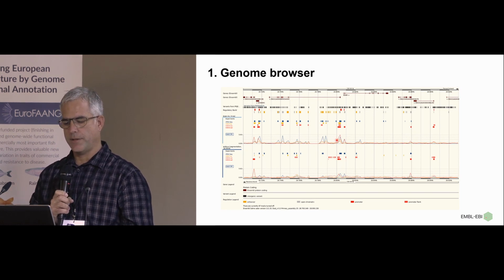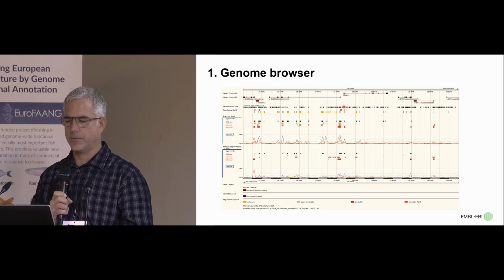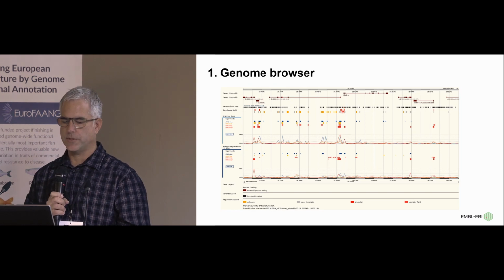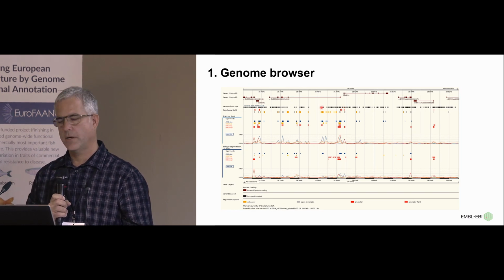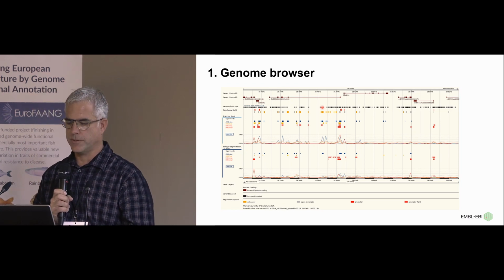down below. And one thing to highlight: one of the goals of AQUA-FAANG is to help focus where variants might be of interest. You can certainly see that some of these variants are going to potentially land in regulatory regions, which are going to be perhaps of much more interest than the ones falling outside.